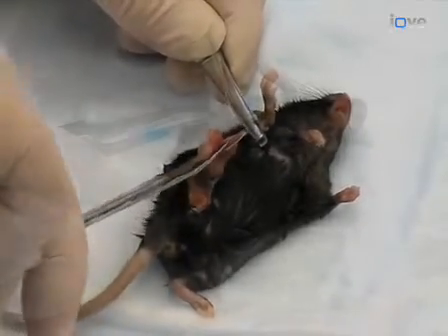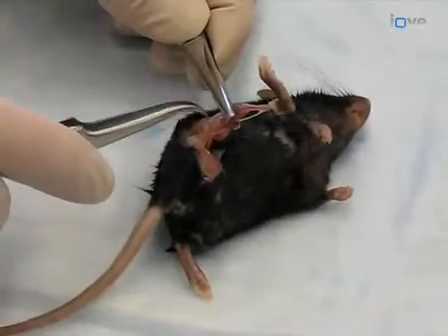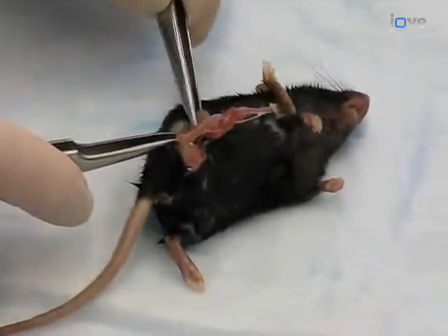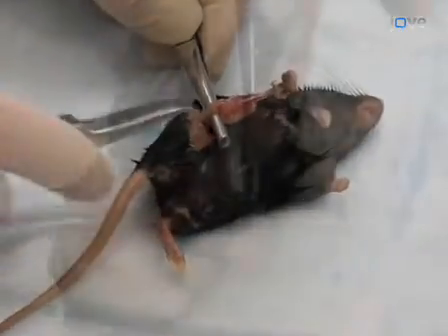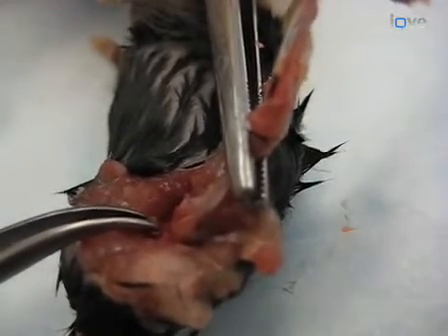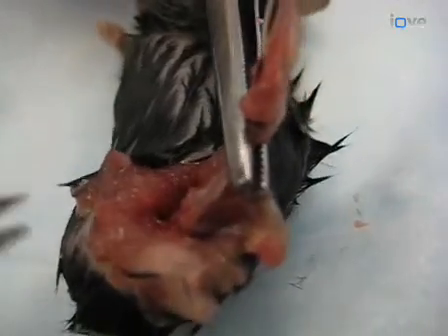To clean the femur, grasp the knee joint with the blunt forceps and use the curved forceps to tease away the surrounding muscle tissue. Cut away the remaining musculature with the scissors, being careful not to damage the bone. Continue to clean away muscle tissue until the head of the femur is clearly exposed within the hip joint. Slide the bone scissors along the femur and over the greater trochanter into the hip joint. With one firm cut, separate the bone and place it into PBS on ice.